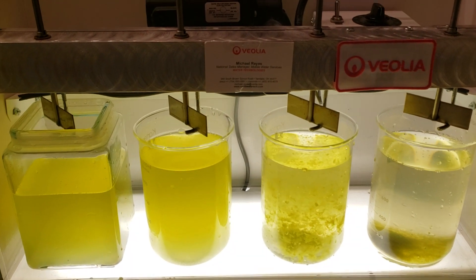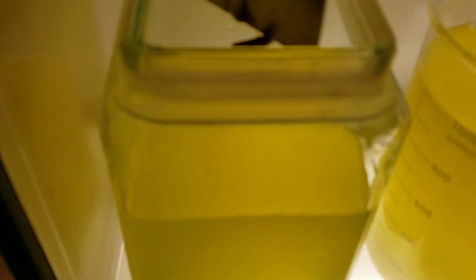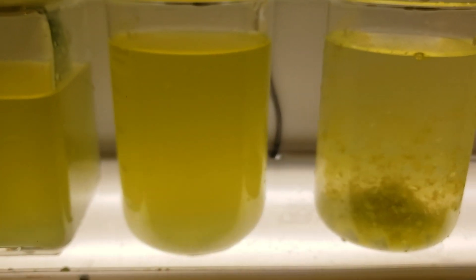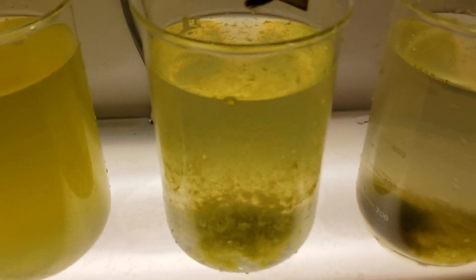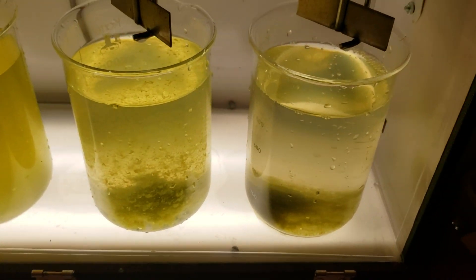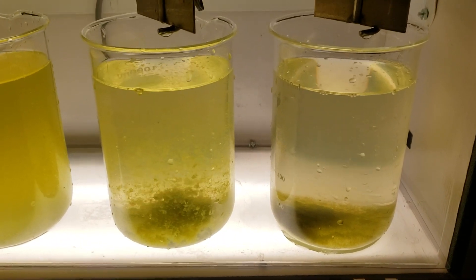We've only been settling for 43 seconds so far. Here is the raw water, water with coagulant added — you can see some floc formation developing. This has got coagulant and polymer added and we've got good strong floc there and actually reasonable settling.